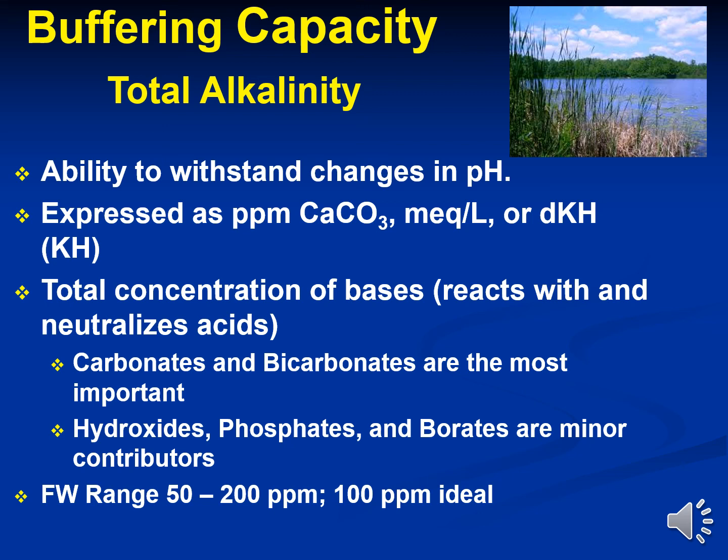Carbonates and bicarbonates are the primary sources for alkalinity measurements. In freshwater, keep total alkalinity between 50 and 200 parts per million. This can be accomplished by keeping crushed coral or oyster shells in the fish tank. The rule of thumb is 1 to 2 pounds of calcium carbonate source for every 100 gallons of water. Total alkalinity is measured typically with a chemical water test kit, which you can get from aquarium stores or an aquaculture supply shop.